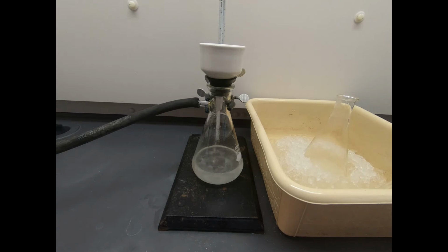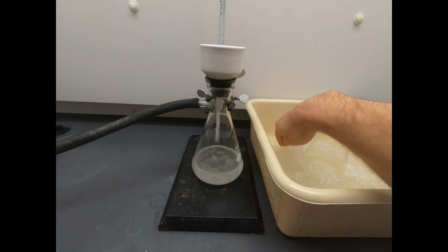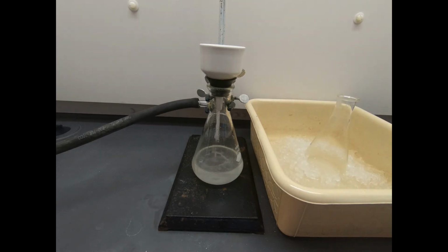Now I say we want to keep it cool, and you could say, well, while you're filtering, it's kind of getting warmer too. Well, it is probably getting a little bit warmer, but that's a much smaller effect than taking your flask and just leaving it sit out on the bench top. We want to minimize the impact, but rarely will we do a perfect job of controlling temperature. We just need to make sure it's good enough.